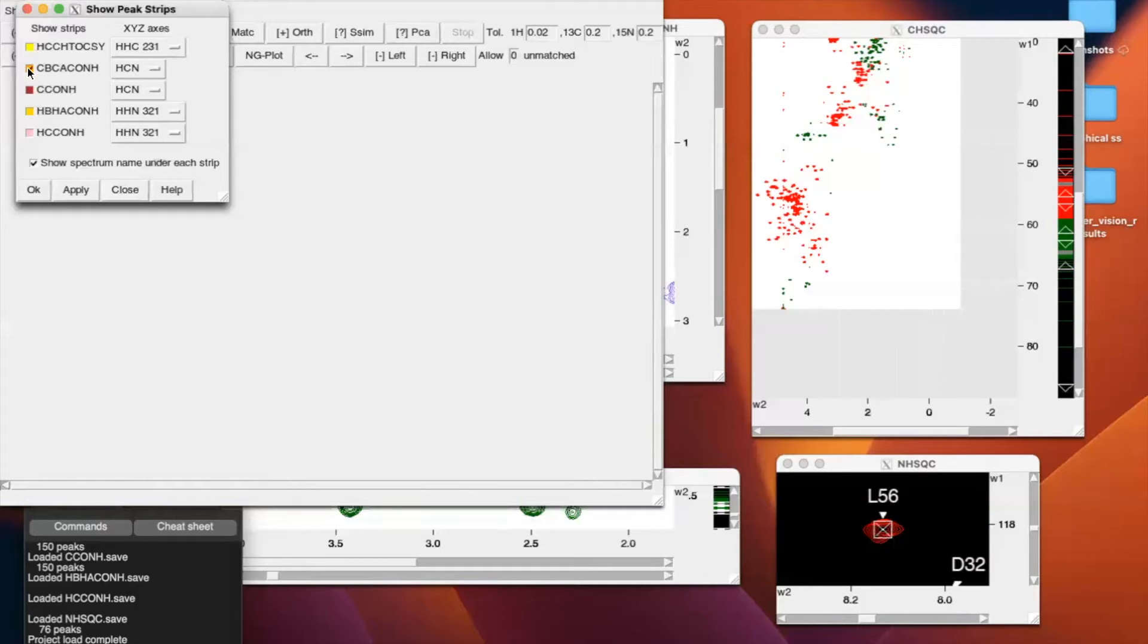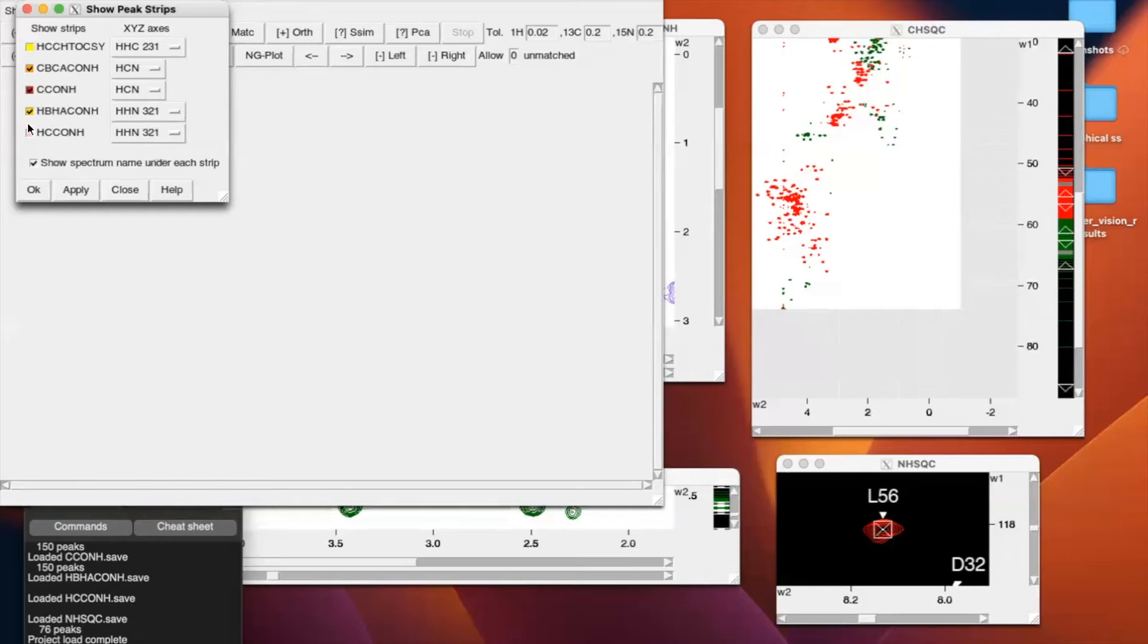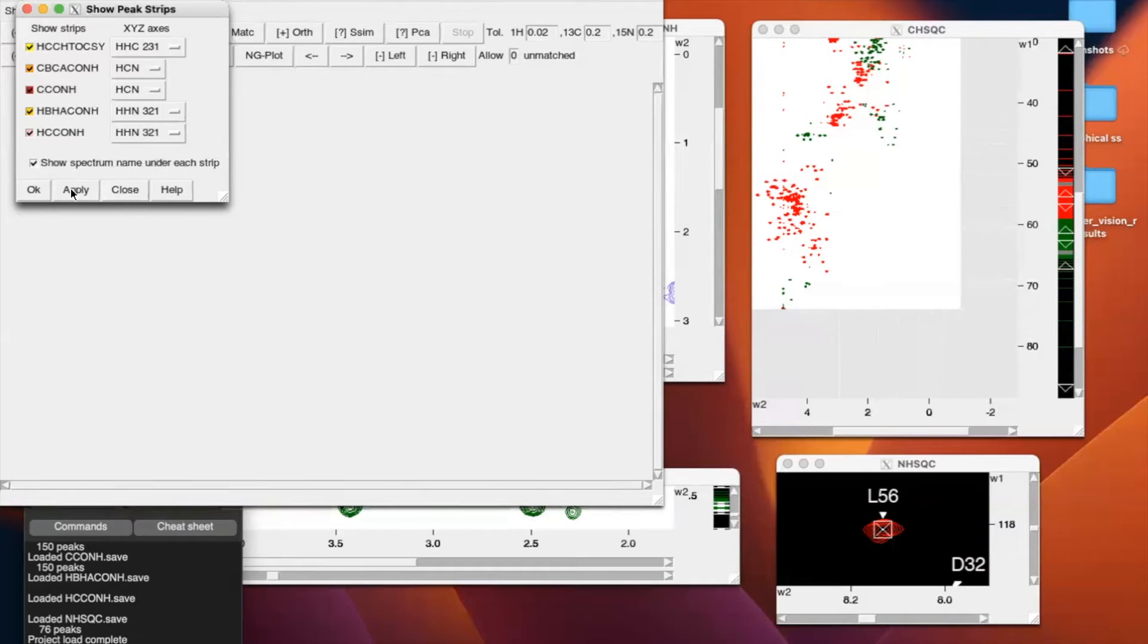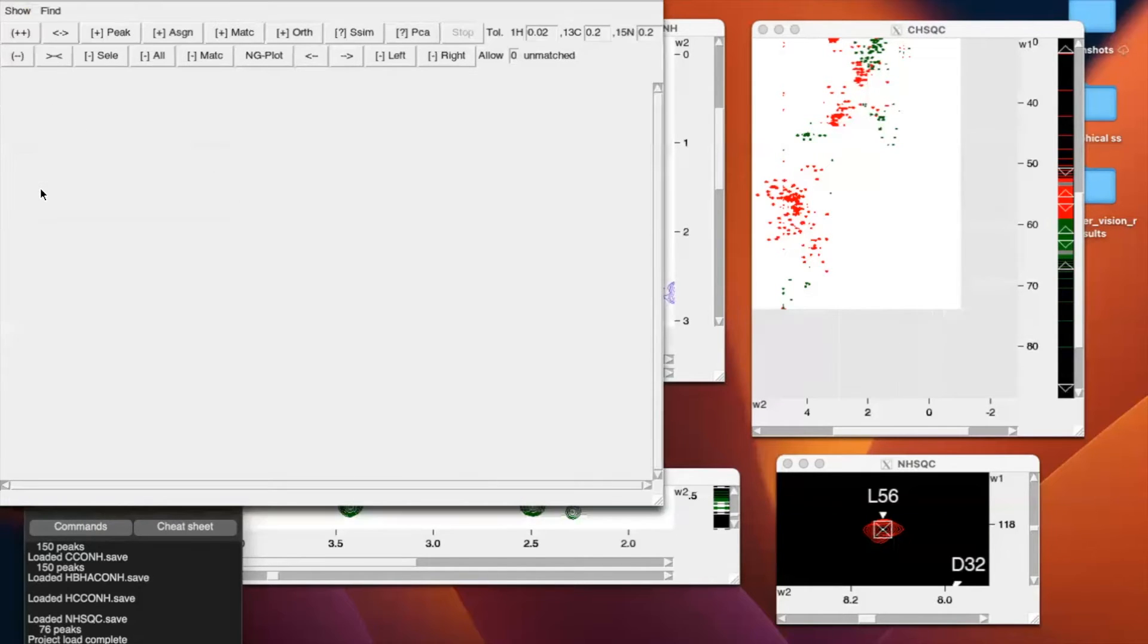So we're going to click in the order we want, CBCA-CONH, CCONH, HBHA-CONH, HCCONH, and HCCH-TOCSY. We're going to show the spectrum name under each strip to help not confuse us, apply, okay. Perfect.